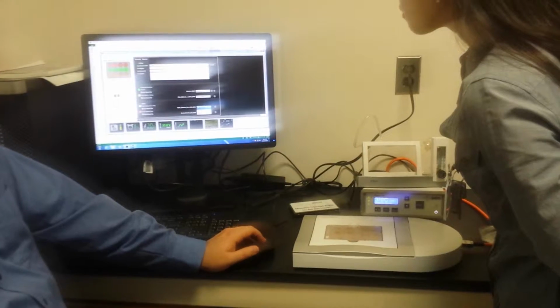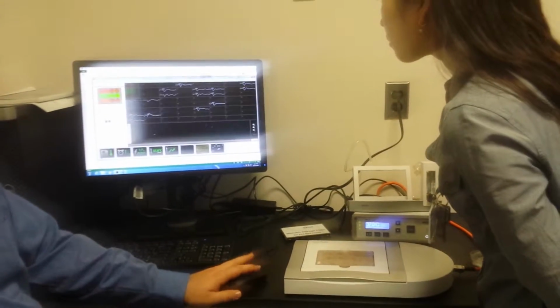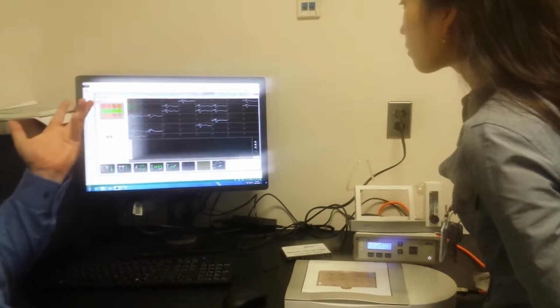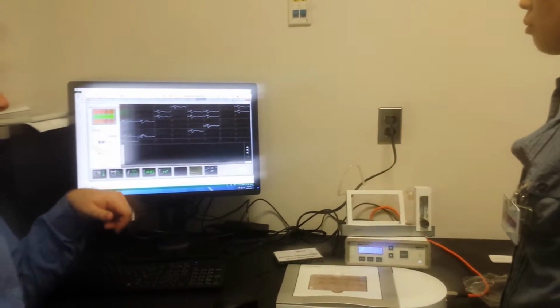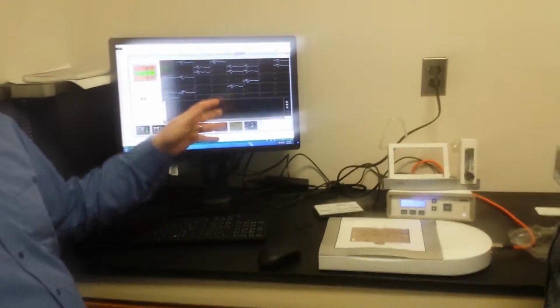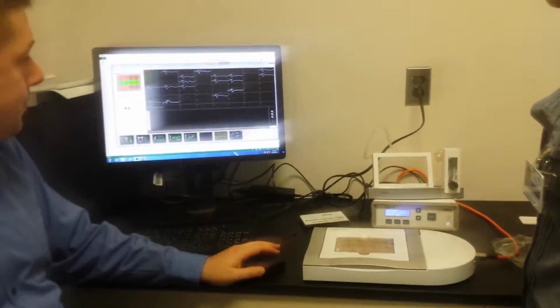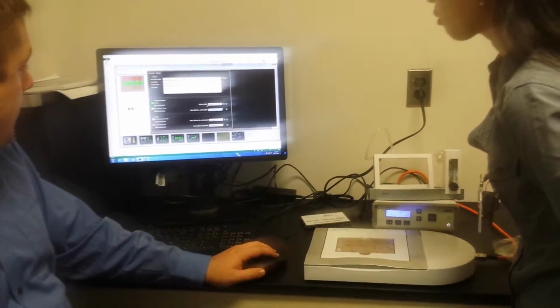Another thing some people will record with the neurons is the axis spike file. What the axis spike file is, is all of these waveforms and their location and time. So if you have a PCA analysis software, usually this is what it'll take in, and we've got MATLAB scripts for converting it over to MATLAB. Can I refer to that? Yeah, absolutely.